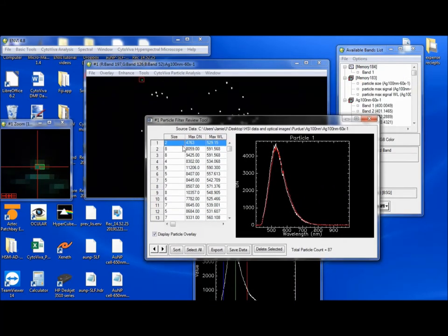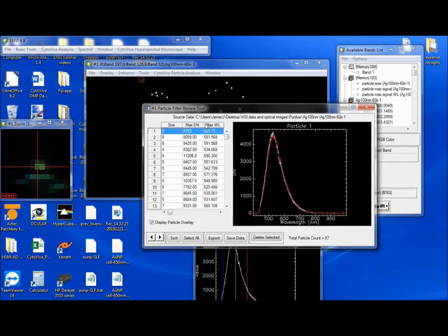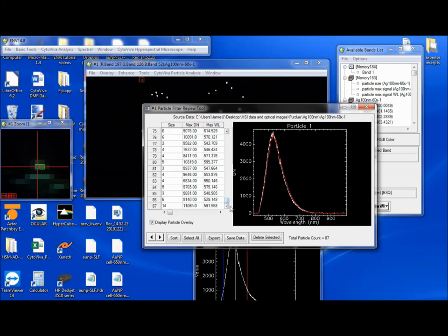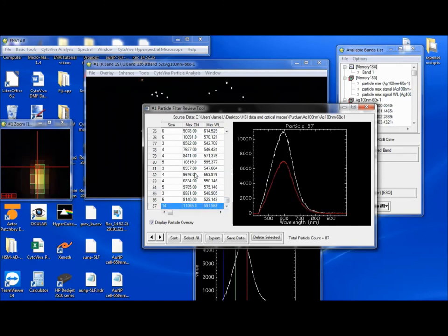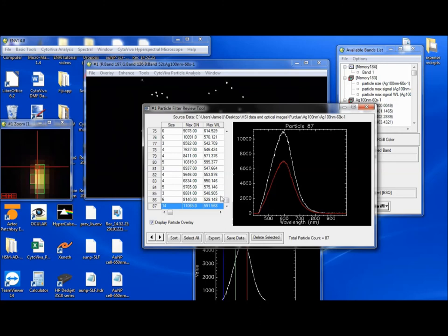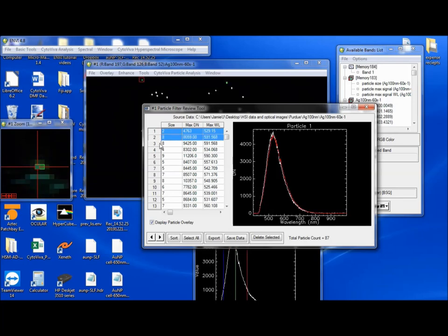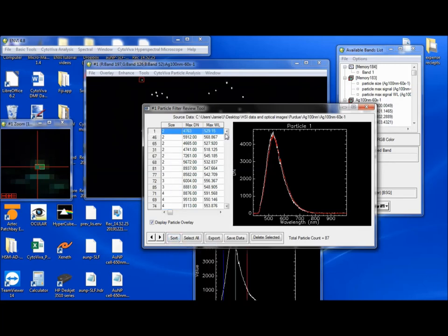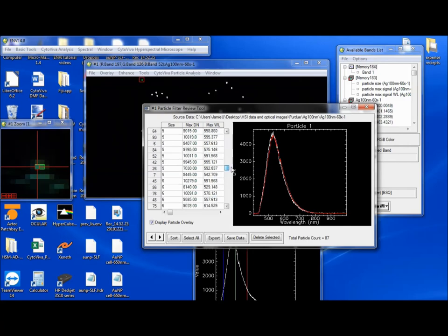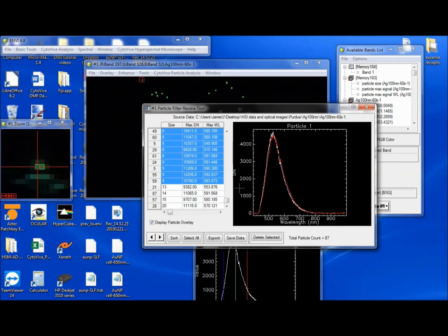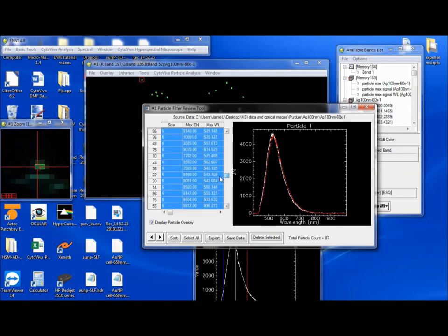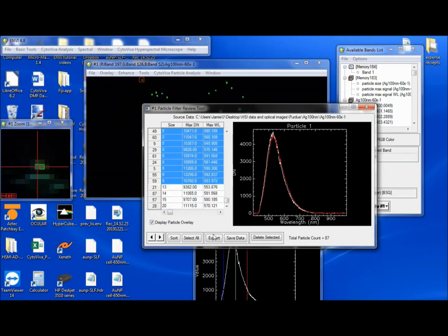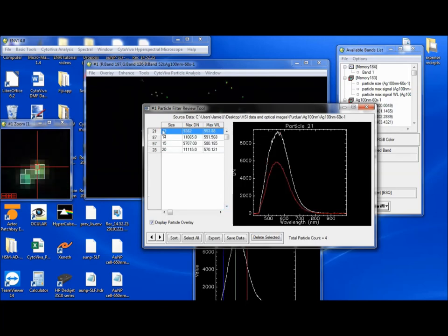And you can also do things like delete. So we had an upper threshold for the size of the particles you wanted to count. We set a 20 pixel threshold at the top. But if we wanted to threshold the bottom, what we could do is we could say, okay, let's just go between 10 and 20. So we could highlight 2 to 8. So we could get rid of all our 2's. I'm just holding down shift going all the way to 10. So anything from 2 to 9 we want to get rid of, we just highlight these, and we just hit delete selected. And so now we're just left with 4 particles. So there's only 4 particles that have a range here.